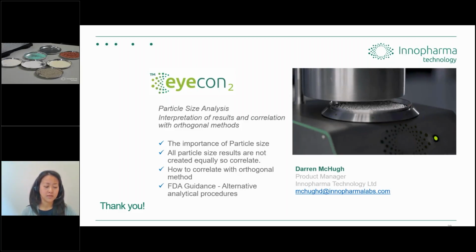We don't have a case study for flour. We have done a lot of milling integrations with pharmaceutical applications, such as roller compactors, the exit of a mill there, which has all been excipients. But we would be up for a trial on a flour process once it was free flowing. I see no issue. Thank you.